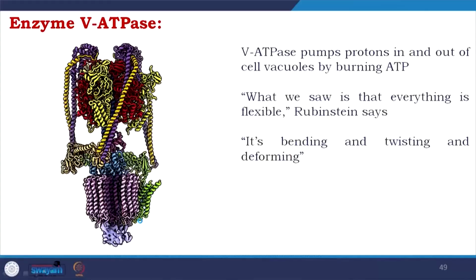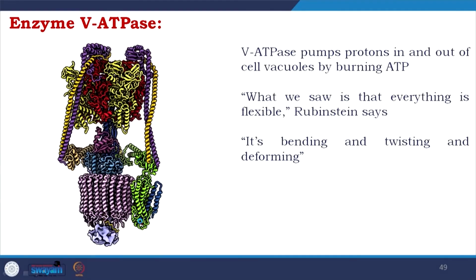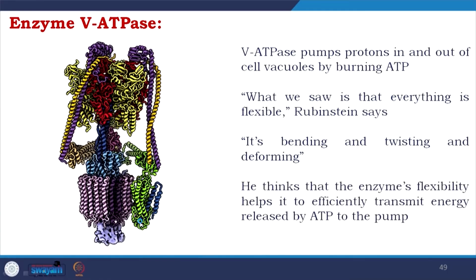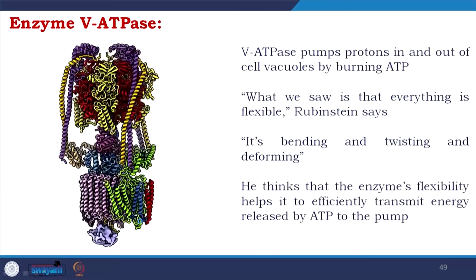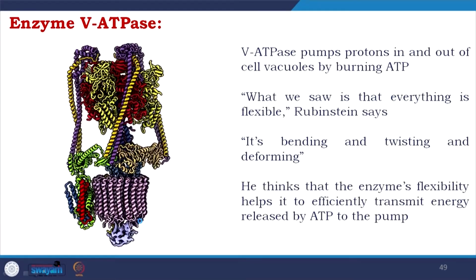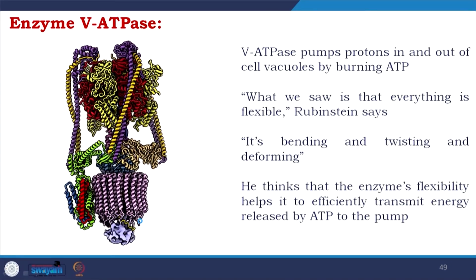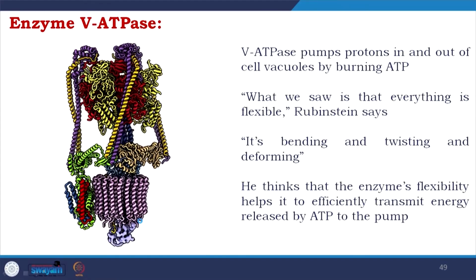It is bending, twisting and deforming. I do not need to show you, you could see the movie presented by them. He thinks that the enzyme's flexibility helps it to efficiently transmit energy released by ATP to the pump. So, now from a high resolution structure, you could also go directly to understanding function.